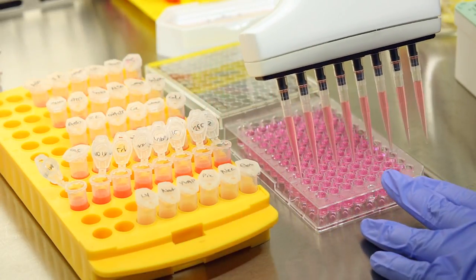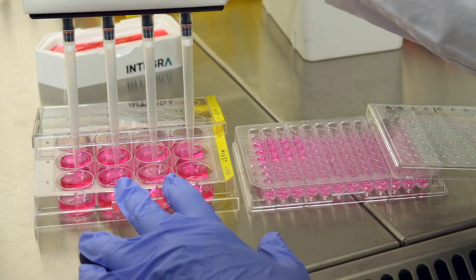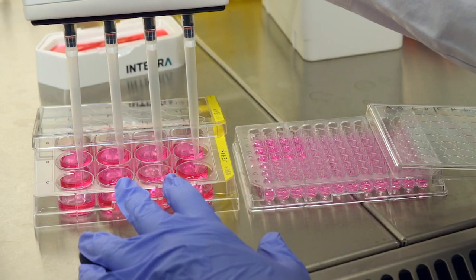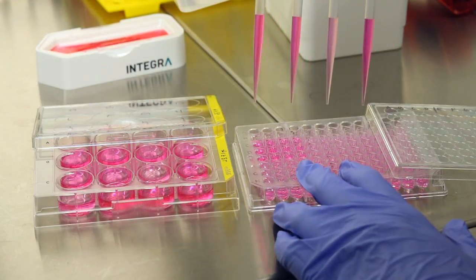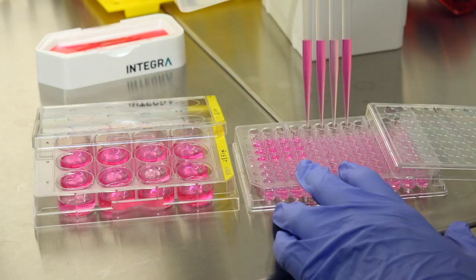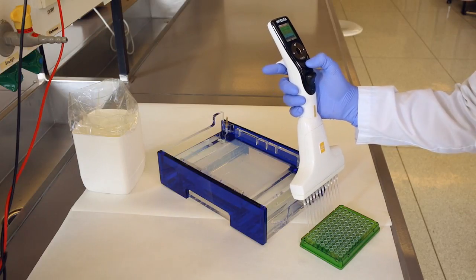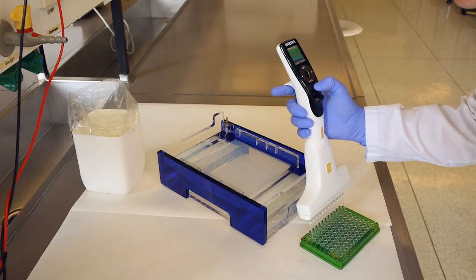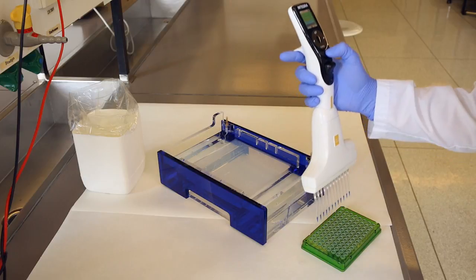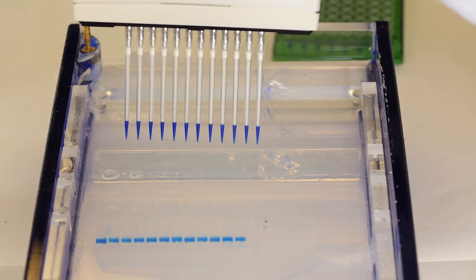Easily transfer samples from tubes to plates. Reformat your samples in different plate formats. And adjust the tip spacing from your source format to any gel pocket distance.